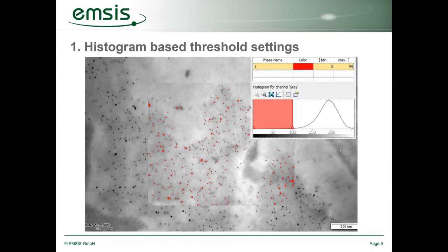You see here already I'm absolutely at the border. The first particles which seem to belong to the background are already detected. But to cope with this, I will give you some ideas later. So that's the very nice tool to use.